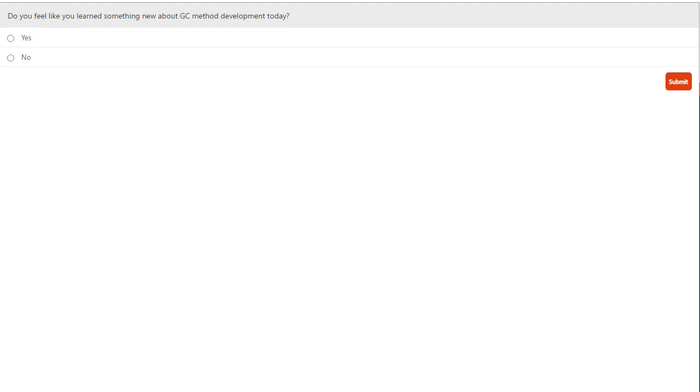Okay. Can you please repeat why you would not need a hold time for temperature when using the split mode? So in the split mode, part of the sample goes directly to split straight off. Any of your components that are going to be removed will get removed instantaneously. Therefore having a hold time is not so critical, because in essence we are just moving the analytes directly on, and we're not holding them in that injector area for a period of time.